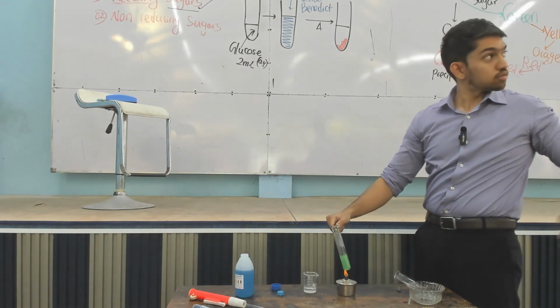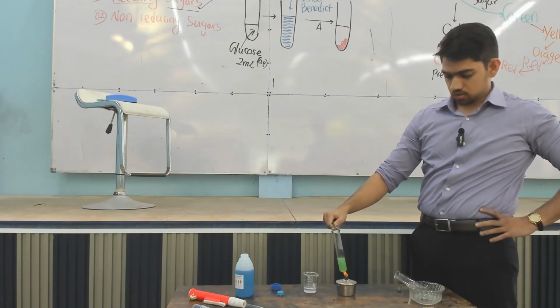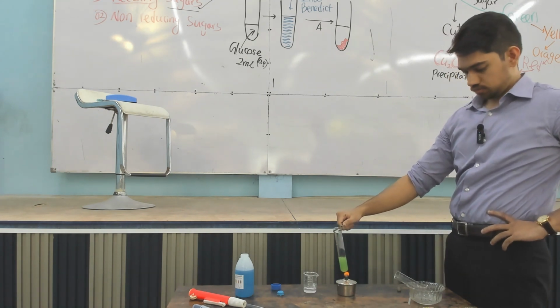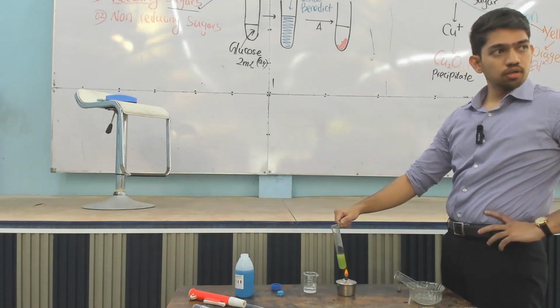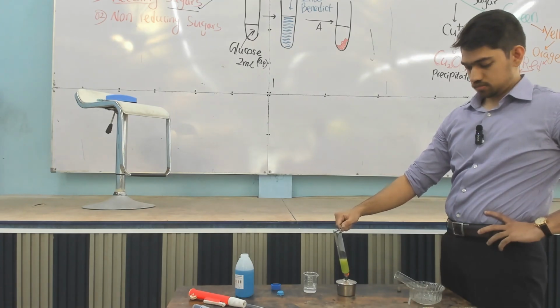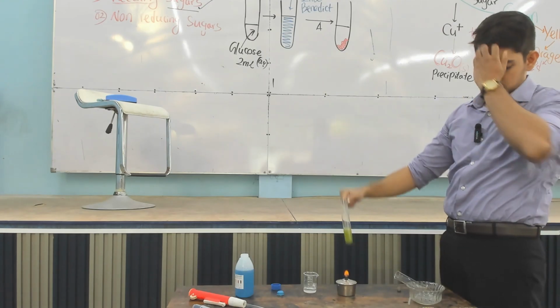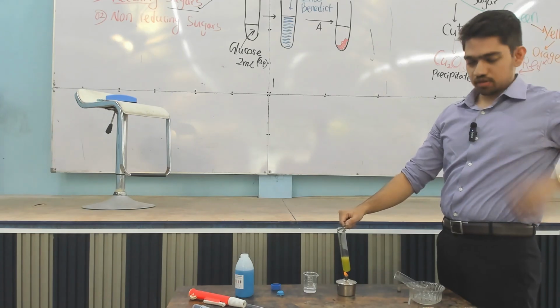There's an AC coming from this side. So we are almost all green now. Now we are getting close to yellow, right? Turning yellow. Online people, can you see? Sort of a muddy pond water again. Let's see what is the end color we can get.